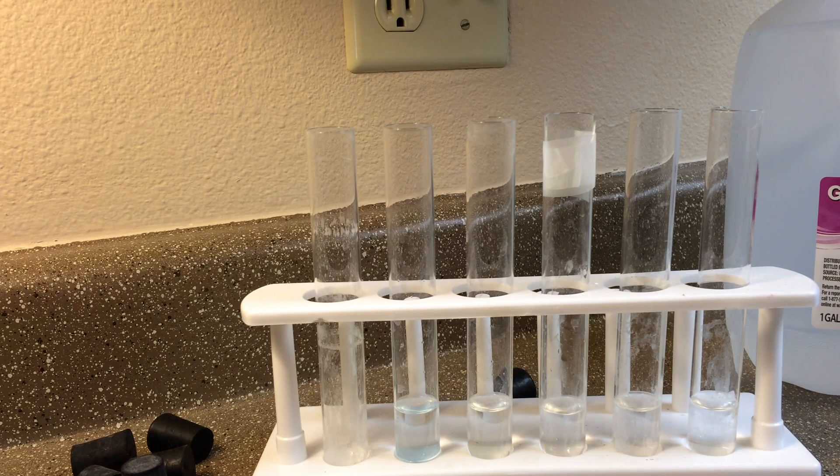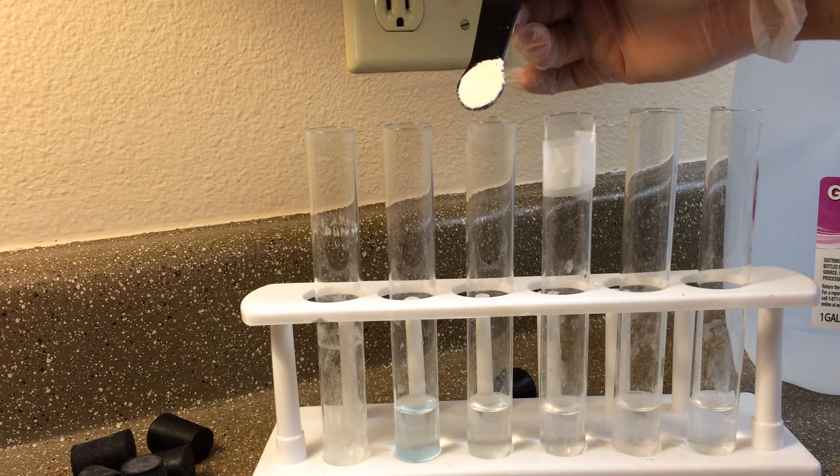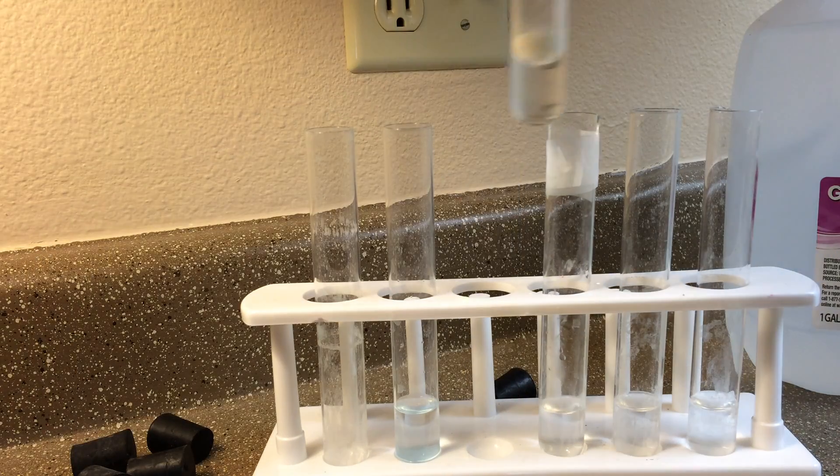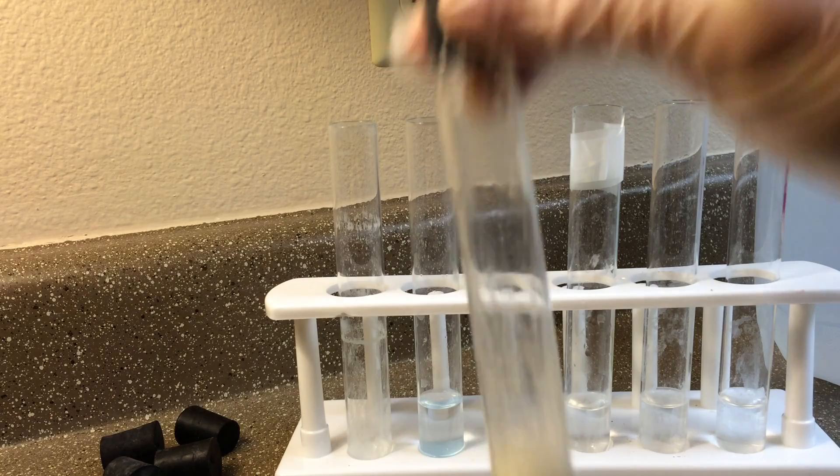Then we're gonna put one half of a tablespoon of albumin in this second test tube, and then we're gonna mix that up really well — just kind of get it to blend as best I can. It does not want to blend, but the protein powder will mix a lot better than that.